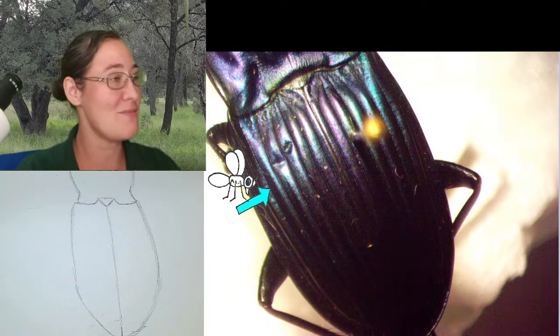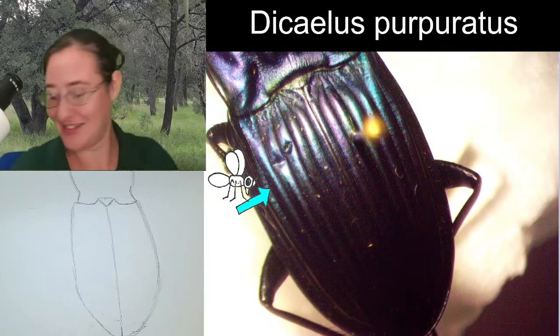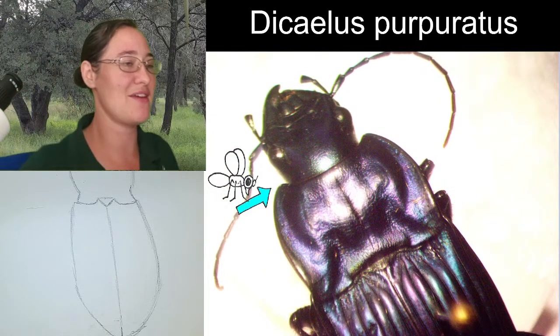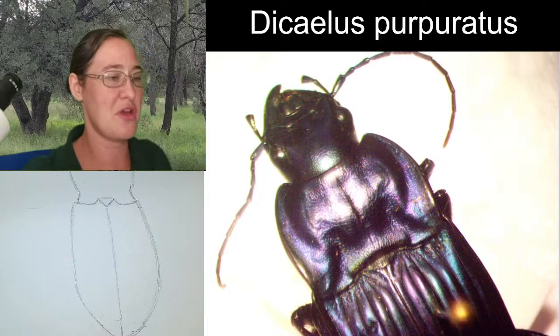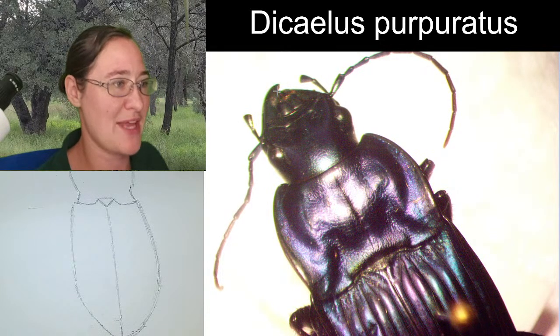Did I give you measurements? Not yet, but I can. Actually, what I'm going to do, because I can't fit the entire beetle under the microscope at one time, I'm going to measure the head and the pronotum, and then I'll measure the elytra. And then we can add them together.